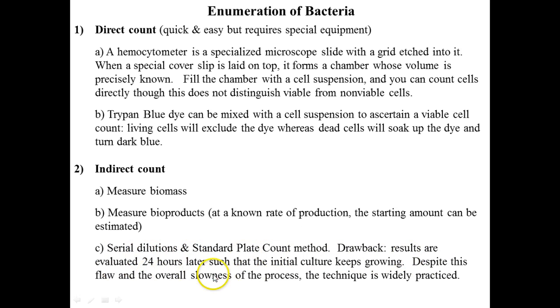The drawback with this is that we're talking about growth, right? And so we've got to wait, right? We've got to wait 24 hours, and we've got to come back. We don't know today what the number is. Whereas with these other methods, we would be able to get immediate results, okay?